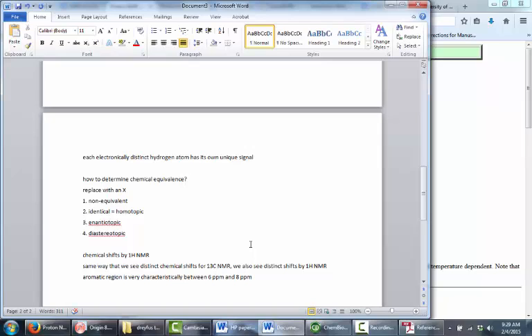If you see a spectrum that has peaks in that region, you can say right away that it definitely has an aromatic ring in it. And conversely, if you see an NMR spectrum without peaks in the aromatic region, it is automatically clear that there is no benzene ring anywhere in that molecule.